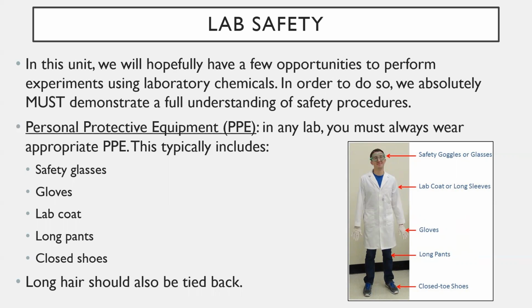Also, if you have long hair, it should be tied back. That way you don't get your hair caught in any chemicals or worse yet, an open flame. So of course, those are some basic safety things to wear.